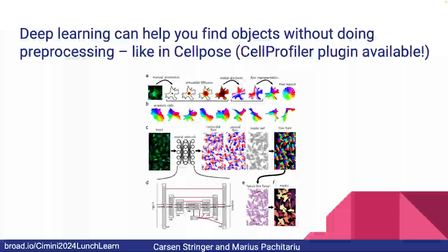It's really great. And ever since CellPose 2, it's also retrainable. So you can have it start from a model that they've already made and then give it your data and fit it exactly to your data. We have a CellProfiler plugin if you make a CellPose model and then you want to use CellProfiler for things like measurements. But CellPose is basically black magic.